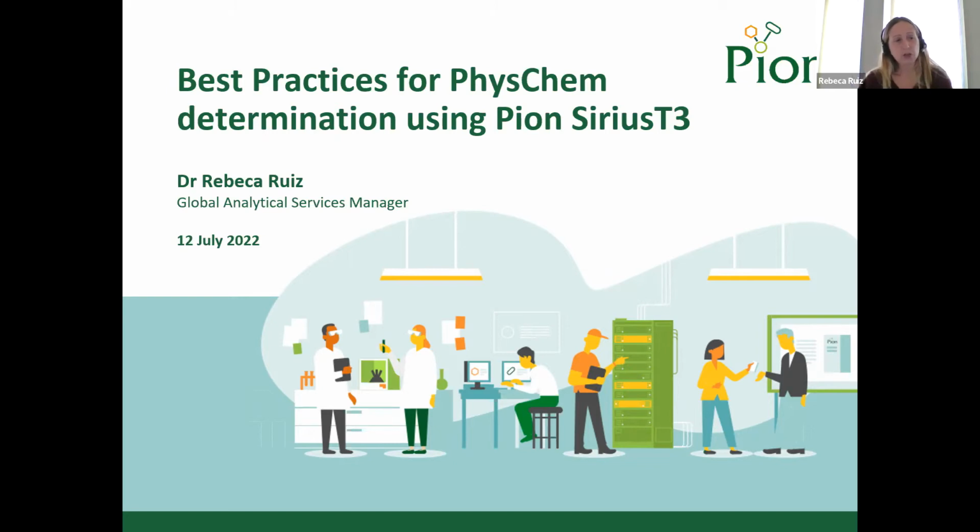This talk is oriented towards Pion Sirius T3 users who are performing daily analysis using the T3, or users who are using the software to process the data. The webinar has a duration of approximately 40 minutes. If you have any questions during the webinar, please write your questions using the Q&A chat box, and the questions will be collected and answered at the end of the webinar.